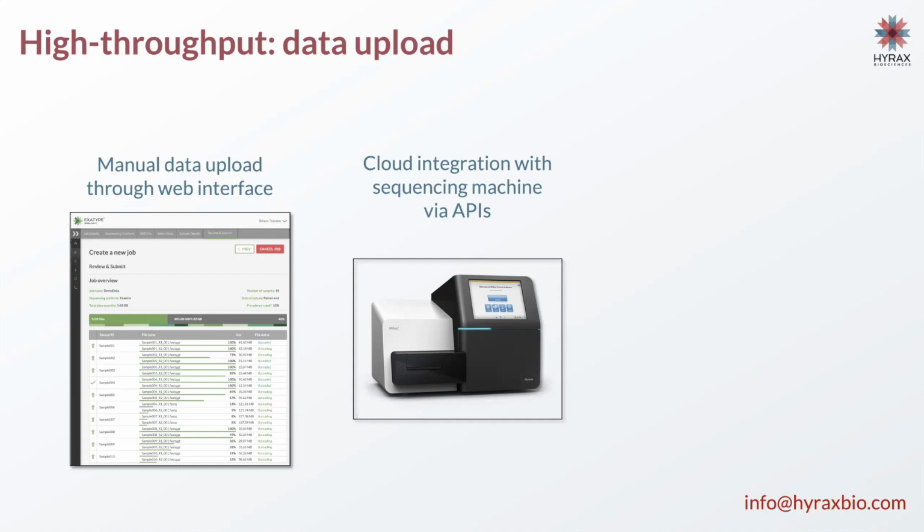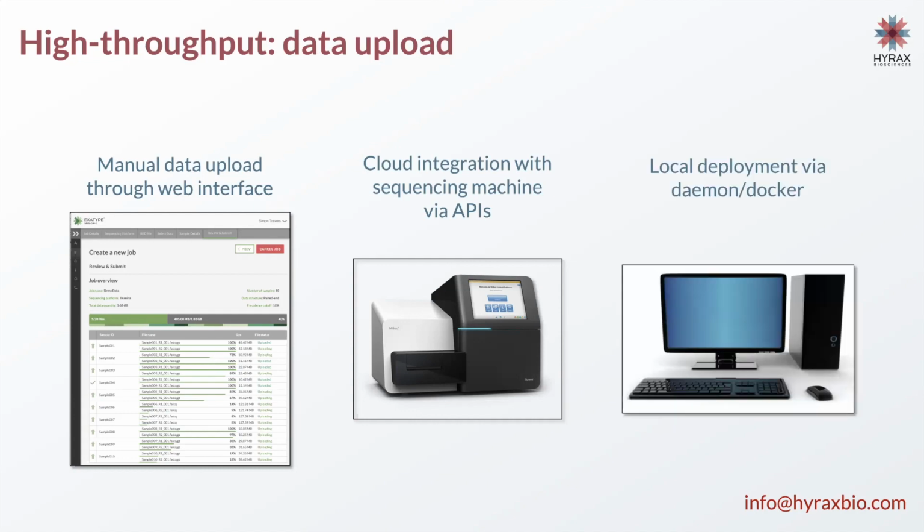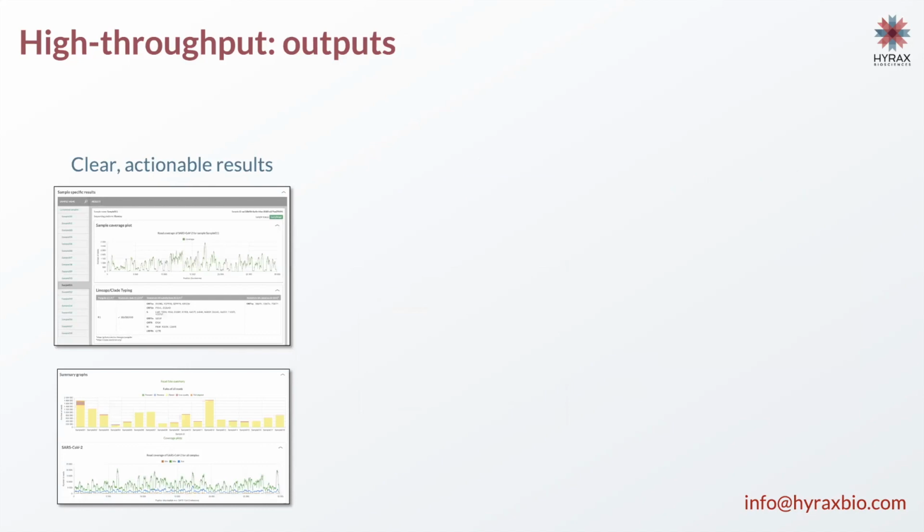And we do also offer local deployment. When I say local deployment, there's essentially two ways of doing that. We can ship you the software, and you can either run it locally using the graphical user interface, so it runs on your browser, or alternatively, there is a high throughput solution where you can run it on a high performance cluster. So there are various options around how you can use Exatype, and primarily that's to enable high throughput analysis that is relevant for you and your users.